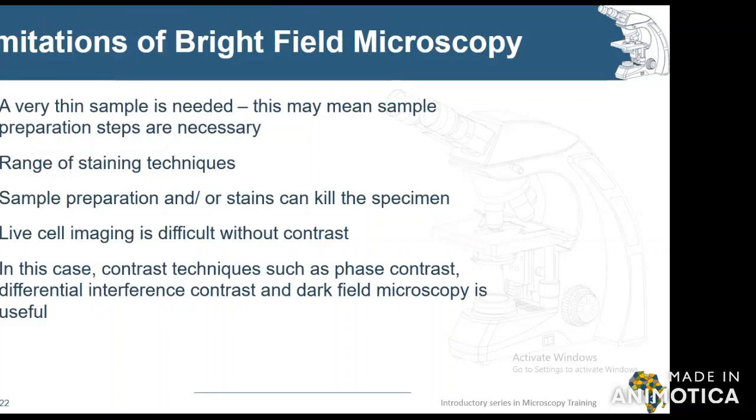Now, looking at the limitations of bright field microscopy, a very thin sample is always needed. It's very, very needed. That makes it compulsory that sample preparation processes take place. There are subsequent lectures that will address sample preparation.